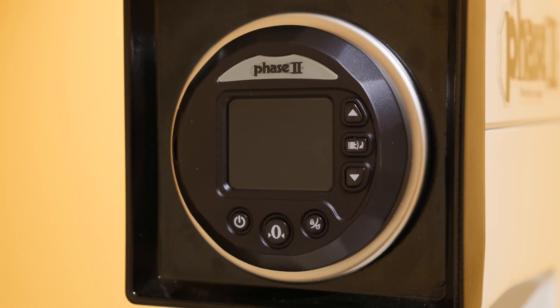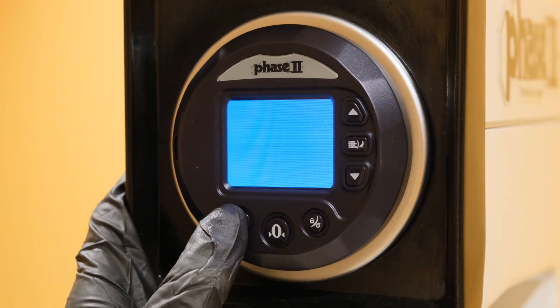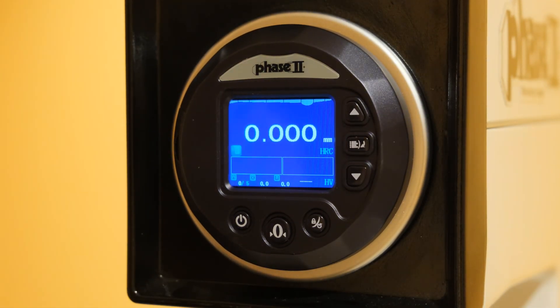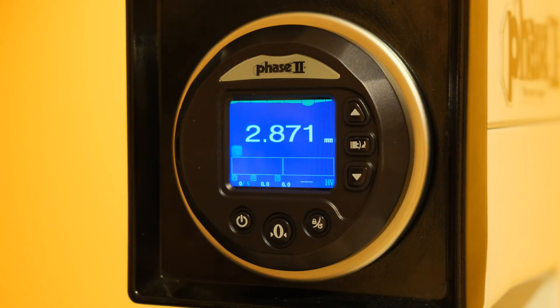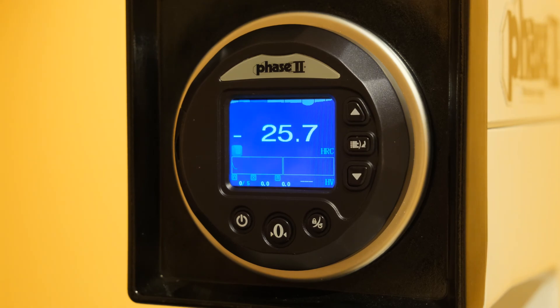The digital indicator functions similarly in principle to the standard analog readout. Prior to starting a test, the indicator should display zero. Verify that the proper weight has been selected and the appropriate test scale is shown on the display. Follow the standard testing procedure, and as the sample makes contact with the penetrator, the indicator value will increase. Once this value reaches anywhere between 2.8 and 3.0, the indicator will beep and the value will change to show 100. Load the sample using the load-unload lever, and the test will begin.